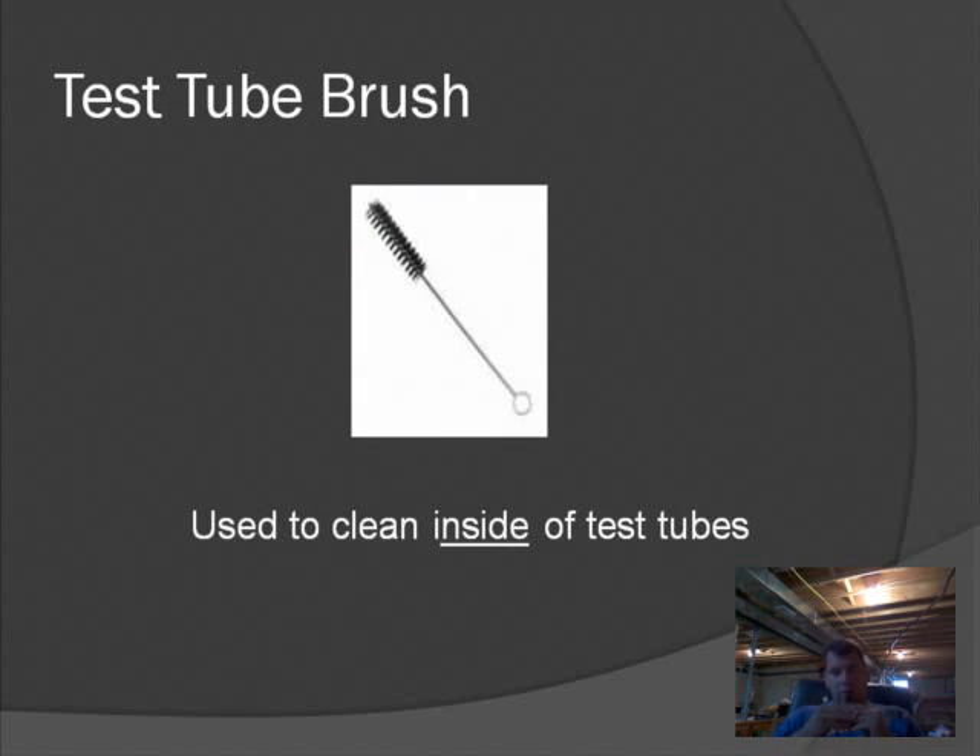The next thing is a test tube brush, obviously used to clean test tubes. Just be careful — I've seen more injuries with a test tube brush than anything else. Students get excited cleaning their test tubes; it gets soapy, you move the brush up and down, and soap and bubbles go everywhere. But if you jam the brush into the test tube too hard, the bottom of the test tube will break off, creating a sharp edge. You could jam it into your hand, which would not be a pleasant experience. So be careful not to hit the bottom of the test tube too hard.